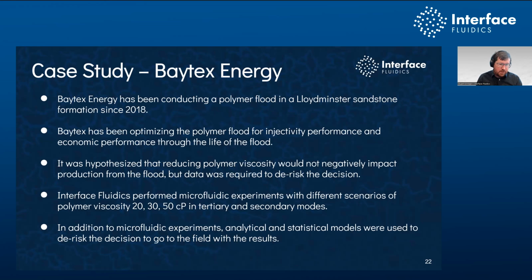So they came to Interface as well as some of their simulation partners, and together we collected a significant amount of data. We performed microfluidic experiments with different scenarios of polymer viscosity of 20, 30, and 50 centipoise in both tertiary and secondary production modes, so post-water flood as well as just initial polymer flood. And they did a bunch of analytical experiments and statistical modeling as well to understand if the microfluidic experiments would be predictive of both field performance as well as simulated field performance.